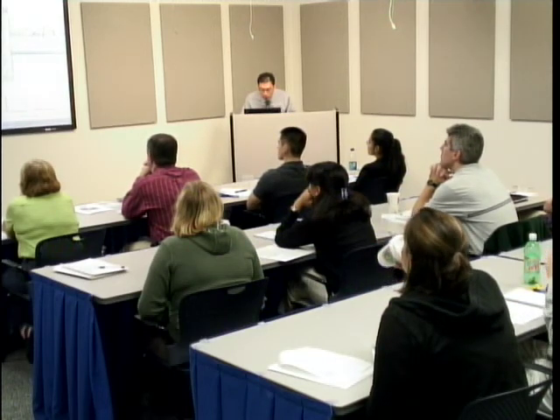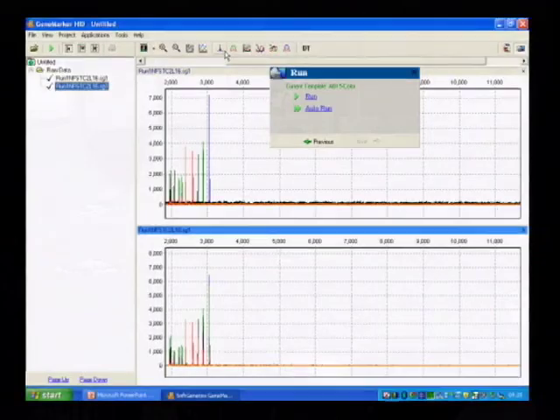It's more an engineering tool. Is there a size limit or something that you look at? What would a bad one look like? Oh, a bad one. So for example, let me remove all the samples and add only lane 16. This will show the differences between the good and the bad one. So I'll add lane 16.